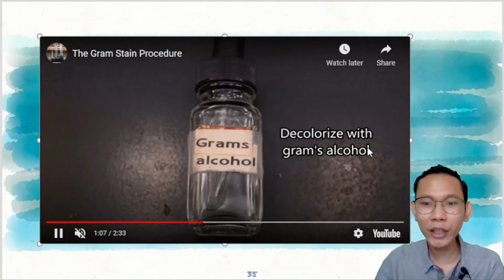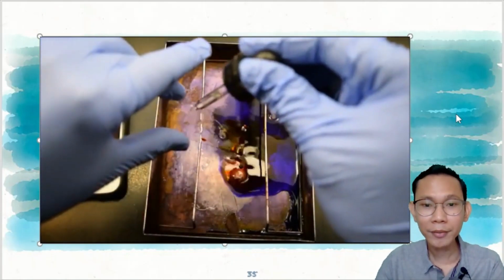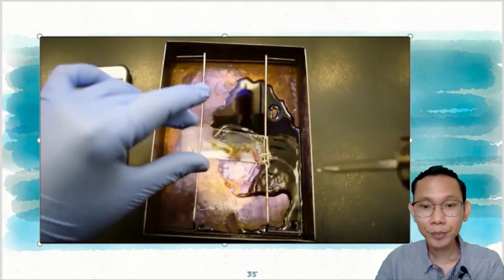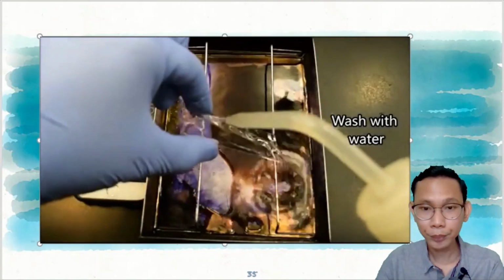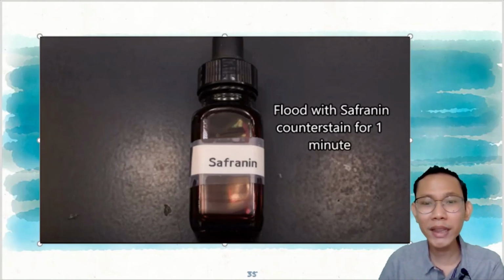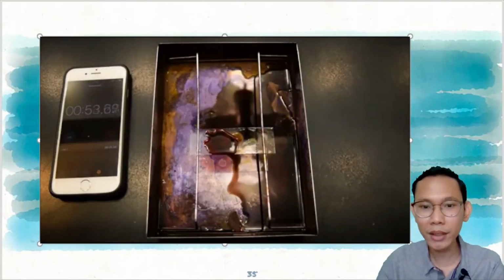So, tatanggalin na yung stain na hindi kumakapit. And then, you do decolorization. Ganyan lang, through slide lang. Tapos, you wash that with water. And lastly, you will add now your counter stain, which is your safranin. So, your safranin now will stain your gram-negative. Nagiging color pink ang gram-negative, kasi technically, your safranin is color pink.